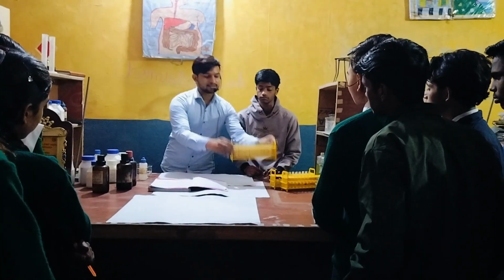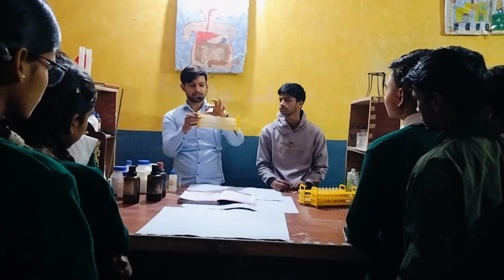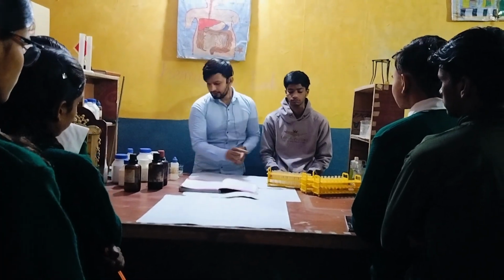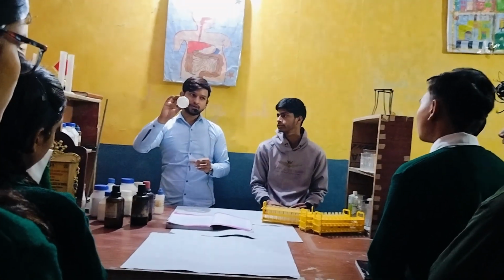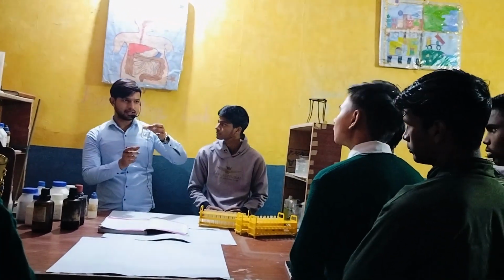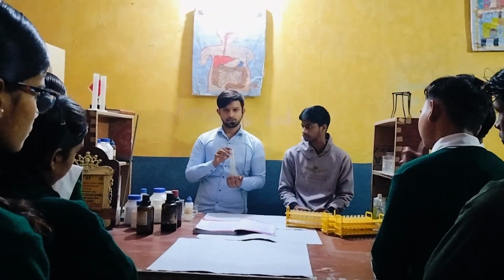So this is the test tube stand, in which we have kept test tubes. These are test tubes, in which we will perform the experiment. And then we have one that is in the shape of a cone, so it is a conical flask, and this is a container, in which we will take the sample. And this is a cylinder.